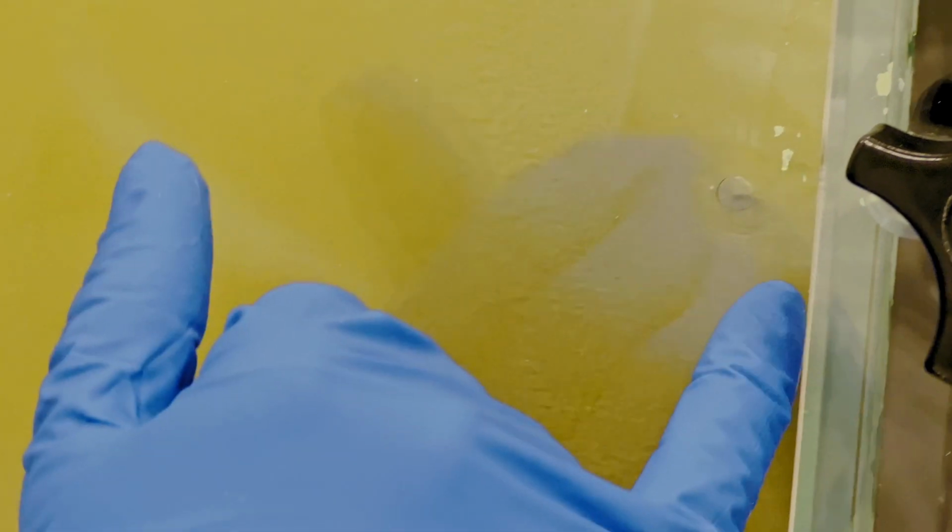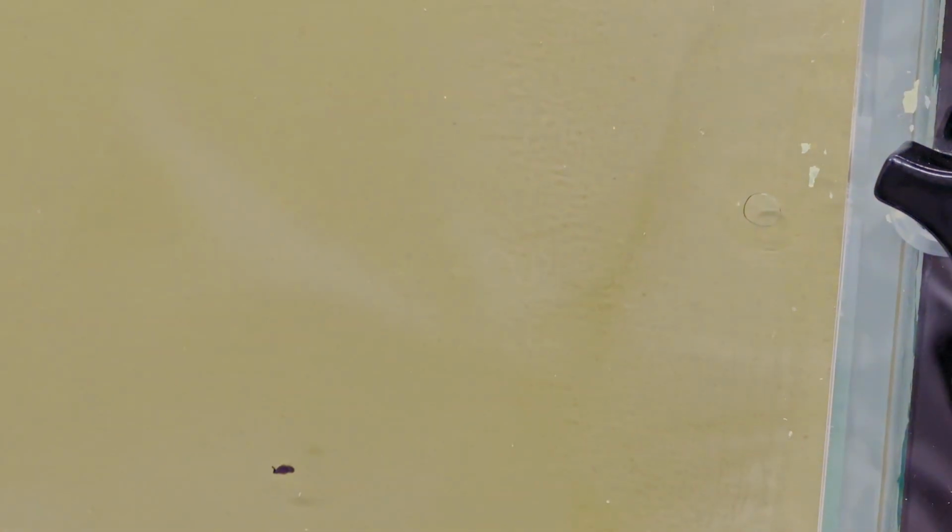This, however, over here is all the way to the side, so it's actually not that big of a problem. But when I see this bubble right here, an imperfection that I didn't see before, it actually is right in the middle of this well right here.